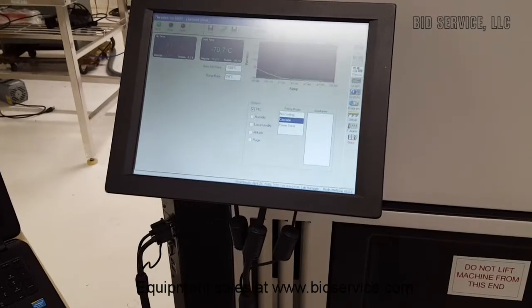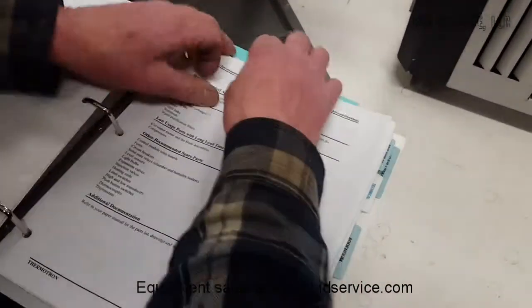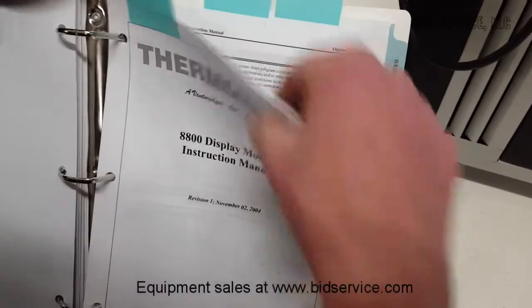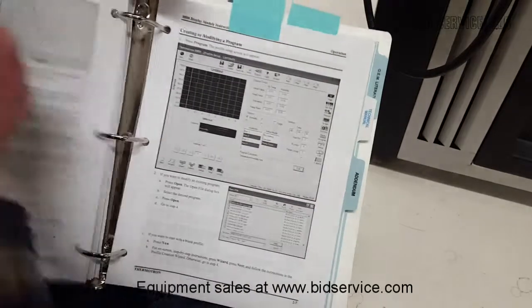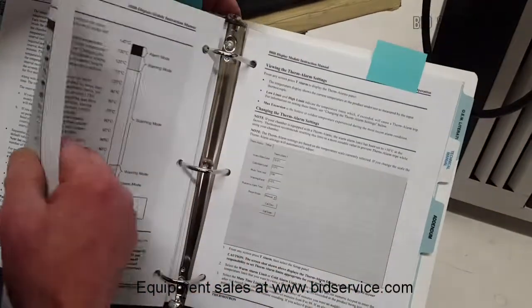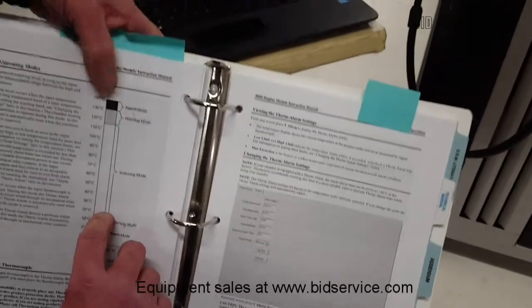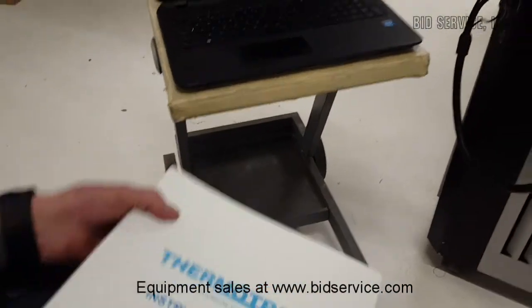The manual is very complete when it comes to using all the functions on the touch screen. It's got an ample supply of service information and parts listings. This is the actual manual on how to run the machine. All of the menu-driven displays are well illustrated in here — how to modify your programs, how to set up profiles. Also importantly, it shows how to set the thermal alarm. The thermal alarm is basically a low level and a high level limit, and it explains how you can set your range, then it'll warn you and then actually alarm. The manual is also available online.